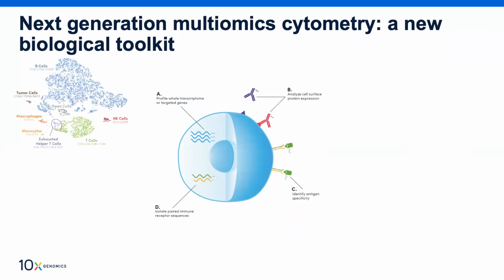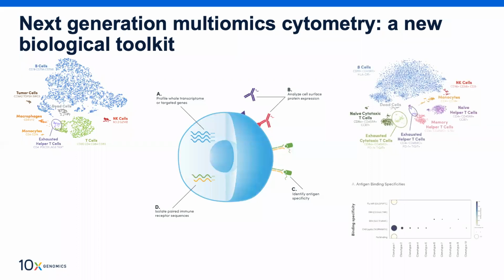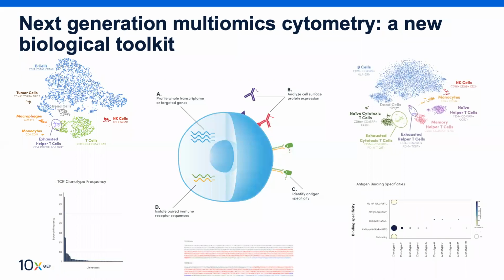So you can characterize the heterogeneity of your tissue by either looking at gene expression, or you can do that by using the protein expression profiles. And when you do that, instantly what you can see is that if you look at this T cell population, which exists as a blob, it's much more resolved when you add an additional modality. So you have multiple perspectives to interpret biology.